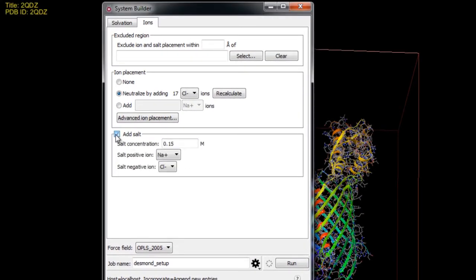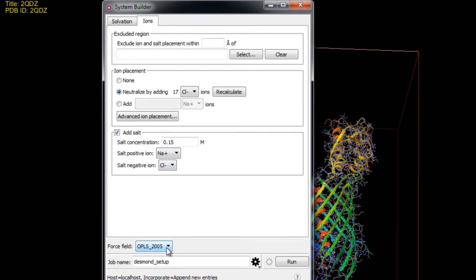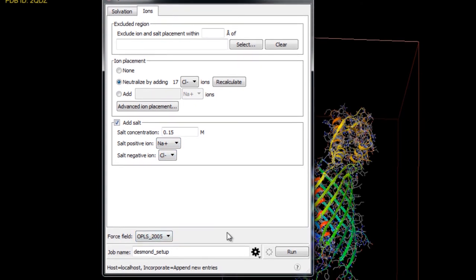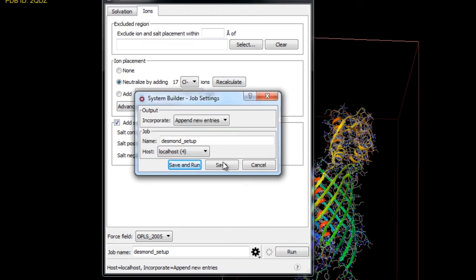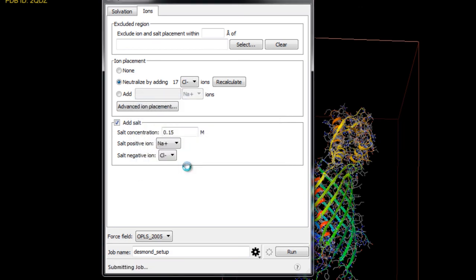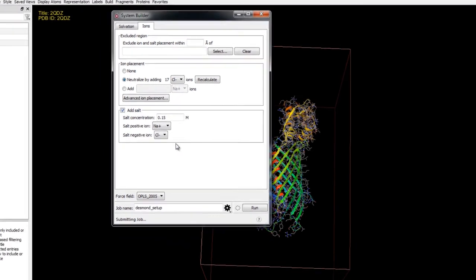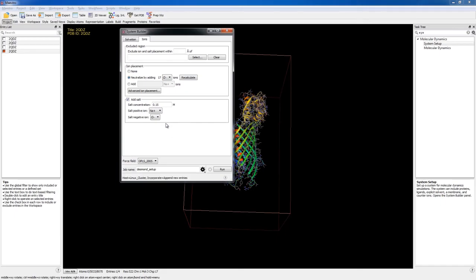Now we'll click add salt and ensure that the salt concentration is set to 0.15 molar to simulate the background salt at physiological conditions. By default sodium chloride is added but you can choose a variety of positive and negative ions for the salt. We'll use the default force field as OPLS 2005 and then get ready to submit the job. Now before we click run we'll open the job settings and then choose a non-windows host. I'm in Windows here so I'll submit this job to a remote Linux cluster. Now just click save and run. System building should only take a few minutes to complete.